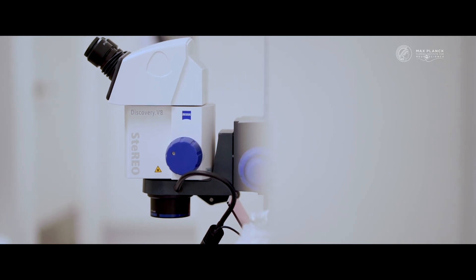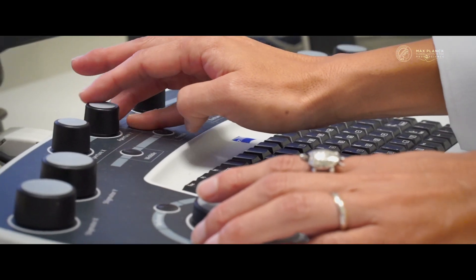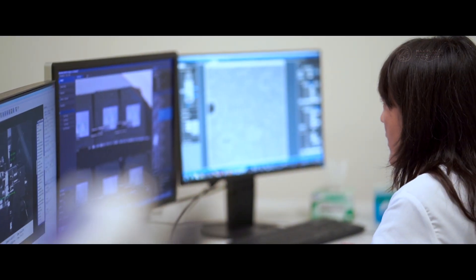We are visualizing brain structure to understand brain function using high-resolution electron microscope. In the brain, there are many features we can finally see only using EM.